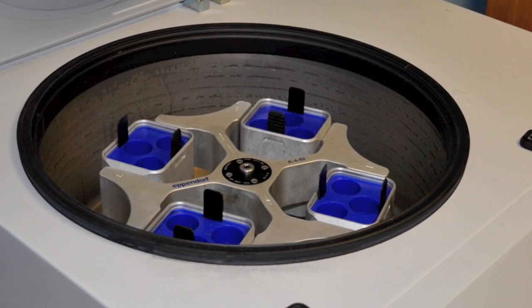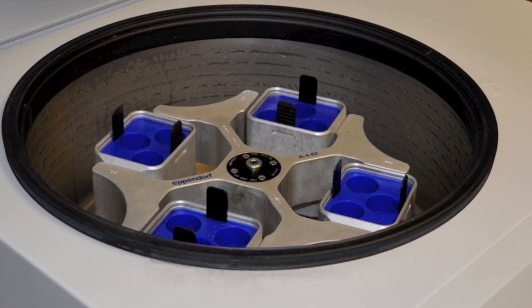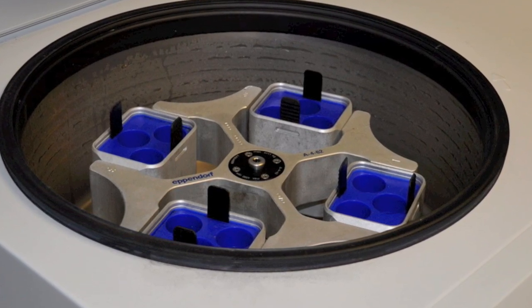It's a refrigerated centrifuge. That's why there's a gasket around the outside, and you can see the lip there where this fits down into it. We can actually freeze materials in here.